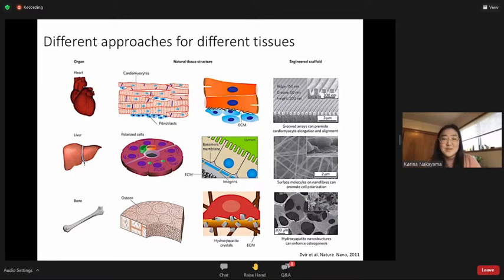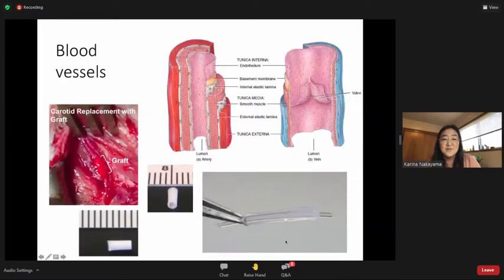And so that's one aspect of what we do in the lab, we create these vascular grafts out of different materials. So I'm going to go to the next slide. And so these materials are made from different kinds of extracellular matrices, like the one on the bottom right, or they're made from polymers. And we do this using electrospinning, which is like a high voltage polymer spinner.